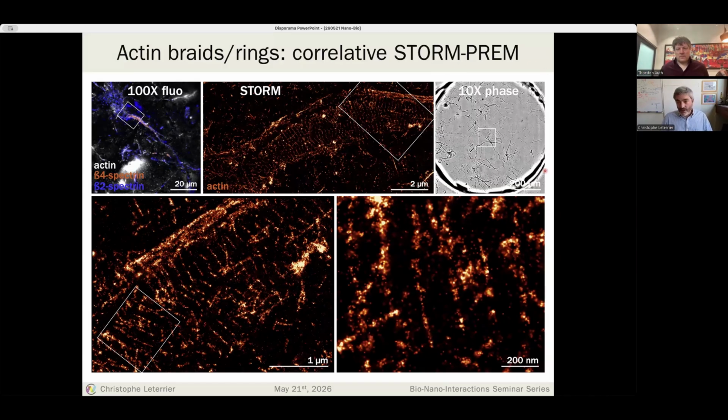And then after that, I would make a circle with the diamond tip objective and send the cover slip to Stéphane in Paris, who would do the platinum replica of this exact same neuron and find it in the electron microscopy. And then we would align the two images. And that was possible because the two techniques have a very high resolution. So you see it clicking when they're aligned.